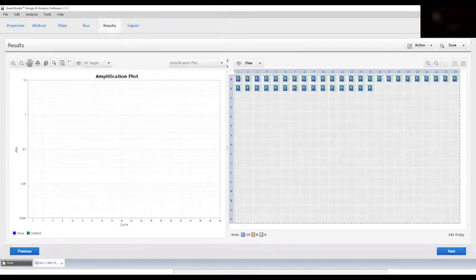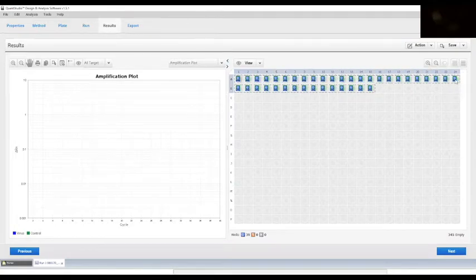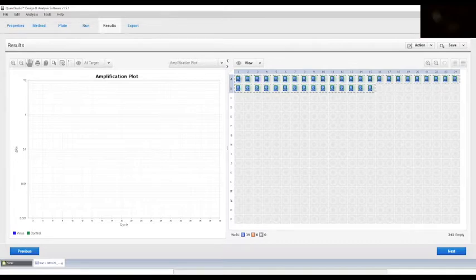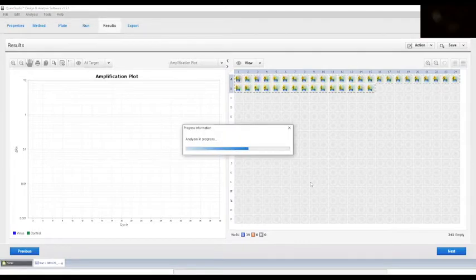The first thing you want to do is mark all the wells that had the sample analyzed. Click on analyze once the analysis has been completed.